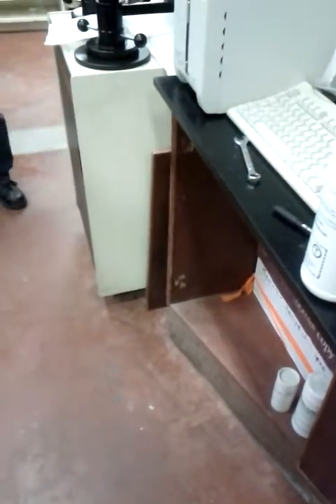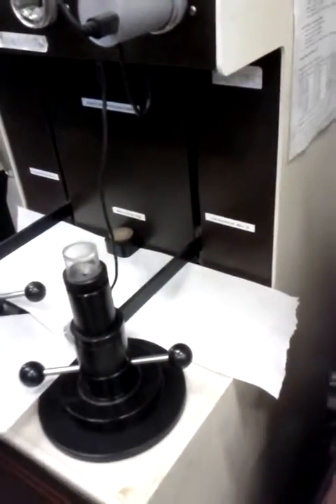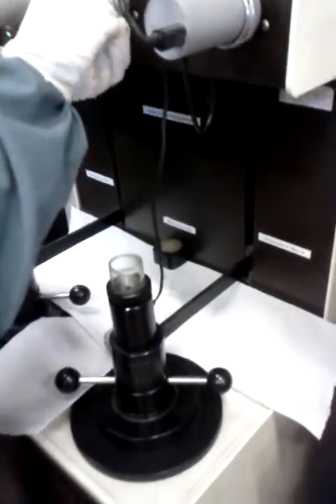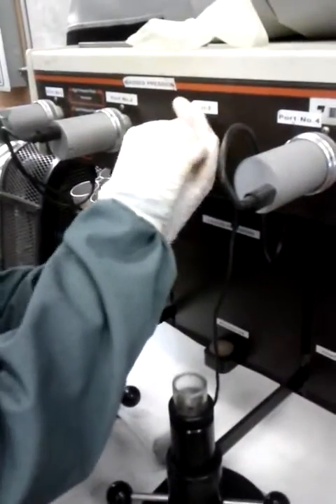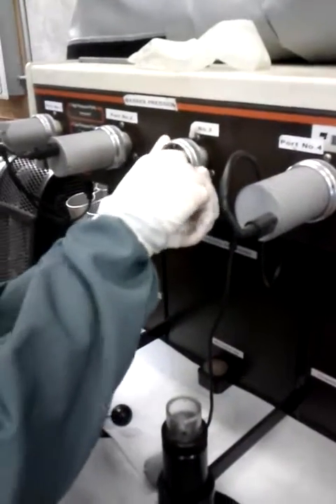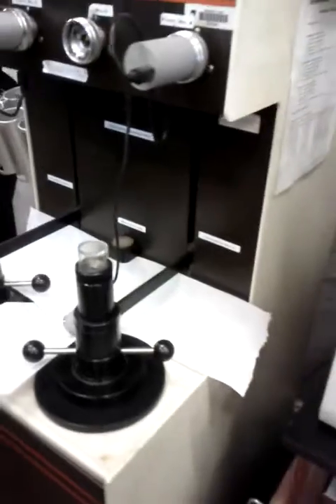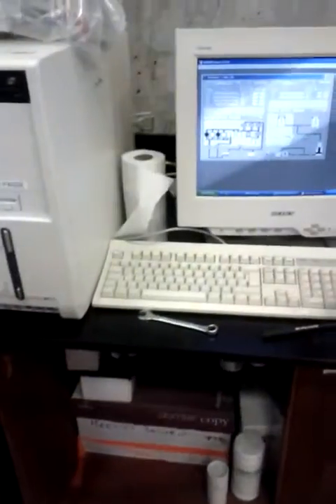Maybe you can go for the second one. You can turn it. I know you get really good, but you have to unscrew. Just a little, it's enough. And with this, we can always check that there is no mercury on it.